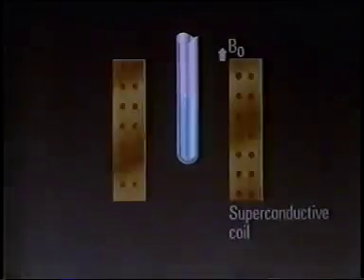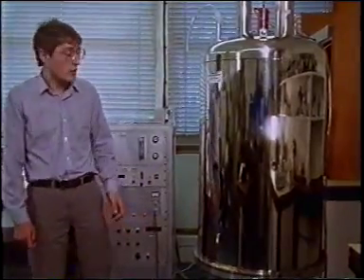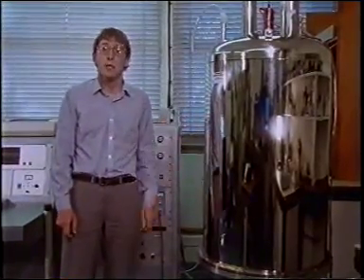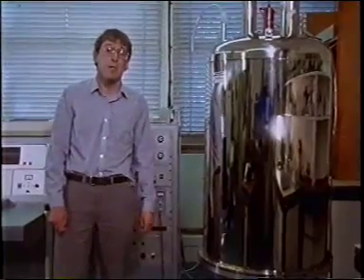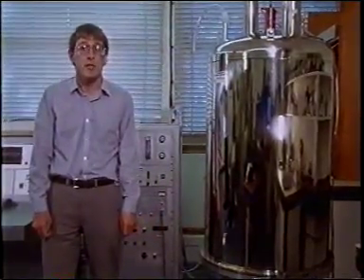If we wish to excite nuclei from a low energy spin state to a higher one, first we must place our sample containing those nuclei into an environment where the nuclear spin states have different energies. That means in a strong magnetic field. In real life, the superconducting magnet is in here. It's cooled with liquid helium to near absolute zero and carries a large current isolated from the outside world.